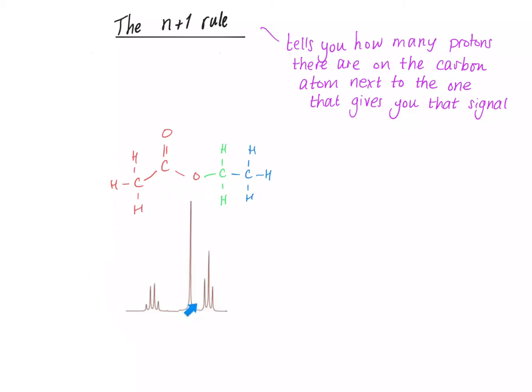these are the three peaks. So if I colour code the peaks according to what they are, this CH3 is this one. That CH2, the green, gives this signal. And that CH3, the red one, gives this signal. So if we look at this CH3, these protons here, this one, this one, this one, are all identical. So they'll come at the same chemical shift.